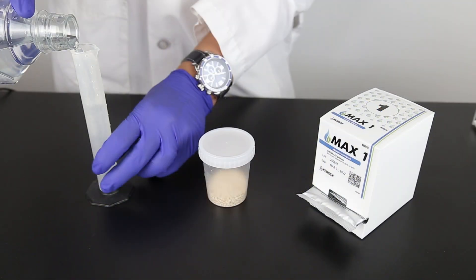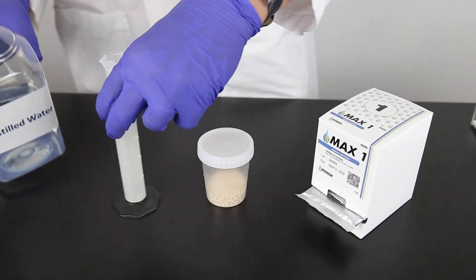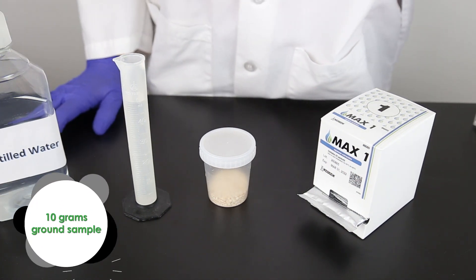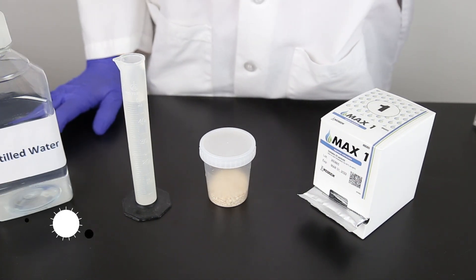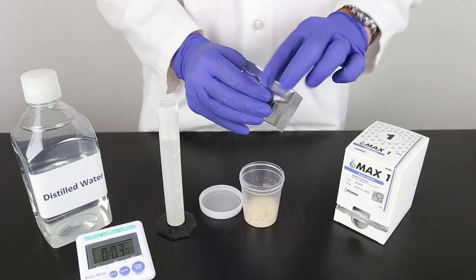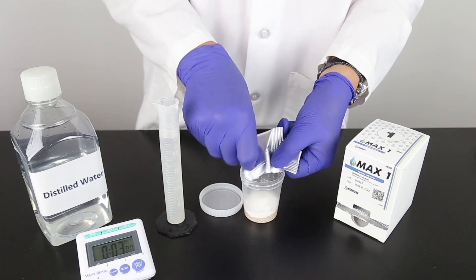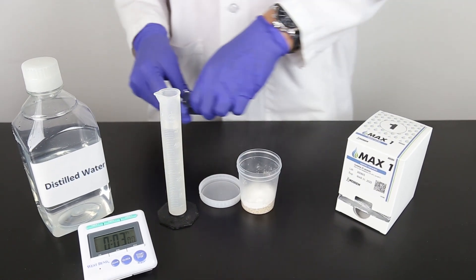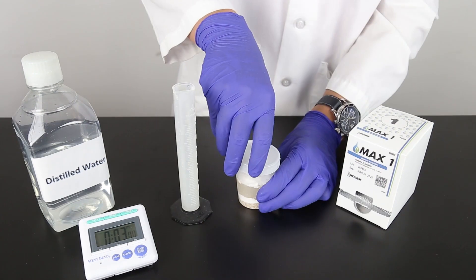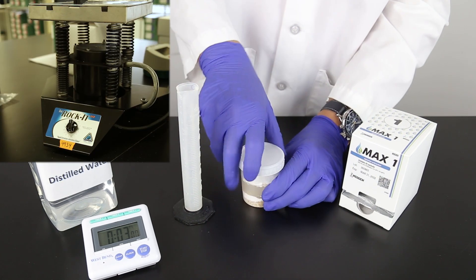The sample is extracted with a ratio of one part sample to five parts of distilled or deionized water. For this example, we're using 10 grams of ground sample with 50 milliliters of distilled water. Each sample uses one MAX 1 aqueous extraction packet. Weigh out the sample, add the MAX 1 packet, then add the distilled water. Vigorously shake for three minutes using hand or mechanical means.